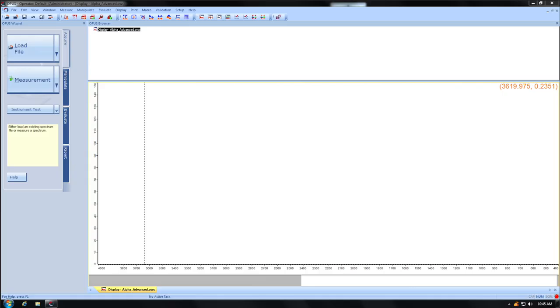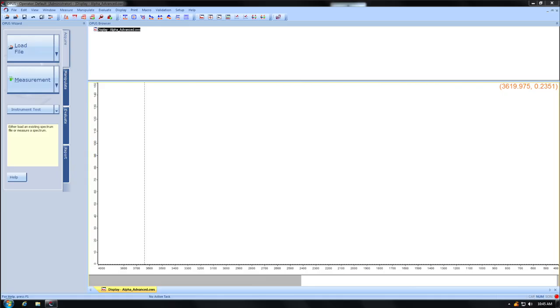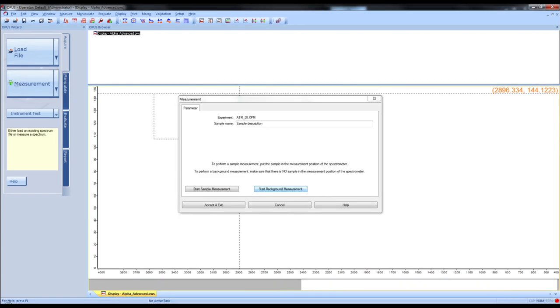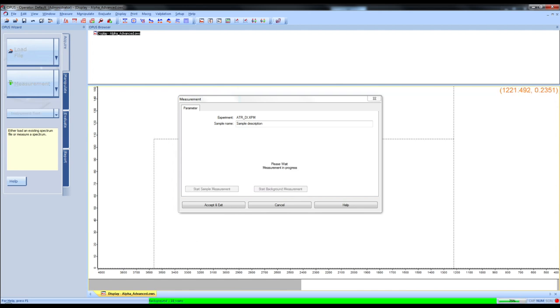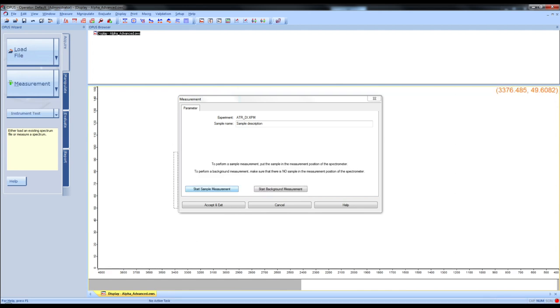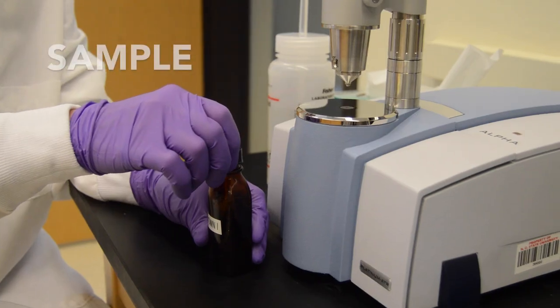This is how you run the background. Click the measurement button on the left corner of the screen. From there, you have two options. Click start background measurement to start the background scan. Once it tells you that it is finished, you can load the sample.